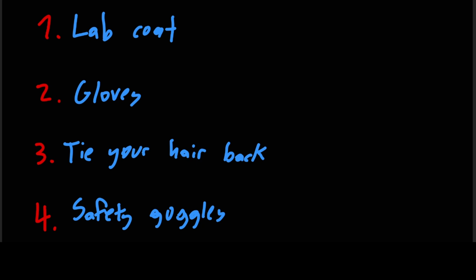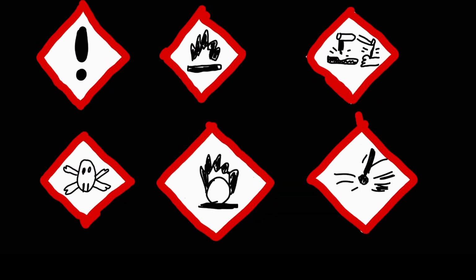You'll be doing a lot of experiments anyway in Junior Cert Science with your teacher, so hopefully you'll have remembered these by the end of 3rd year. Now we're gonna go through warning symbols, and yes, I put it through all caps, and yes, I had to shout it. These are important, maybe not so for the exam, but for your own life. So I put a lot of effort into drawing these, so please try and remember them. If you have learned these, try guess them before I go through the answers.